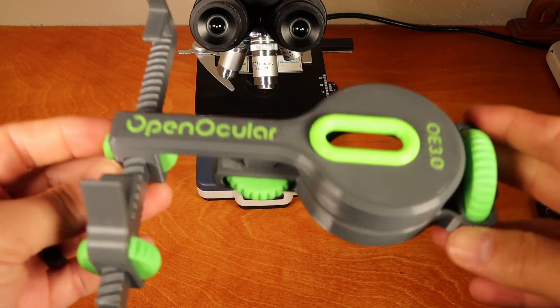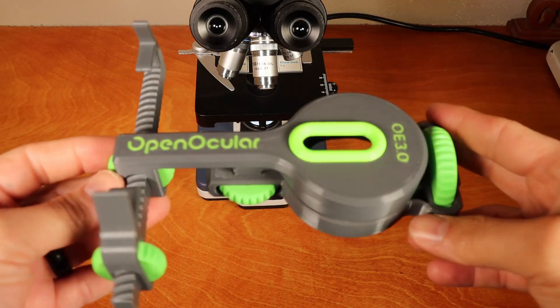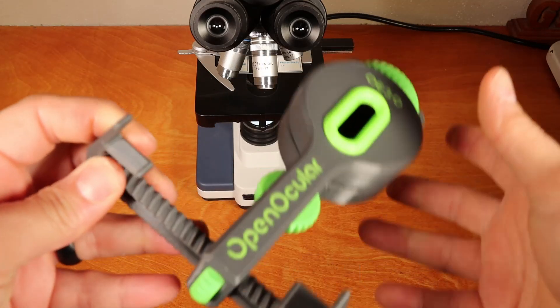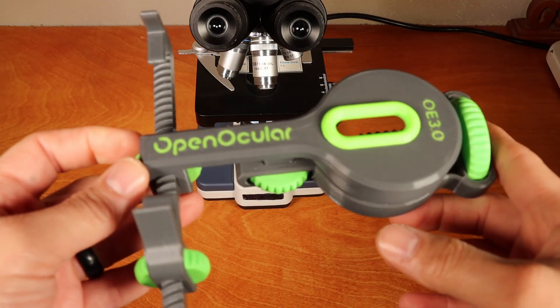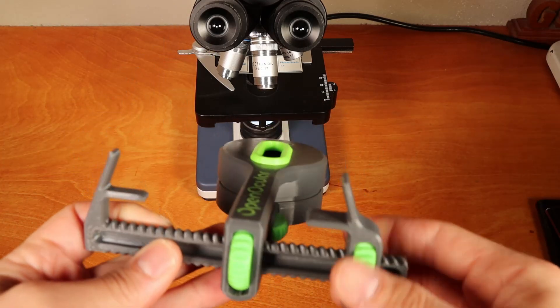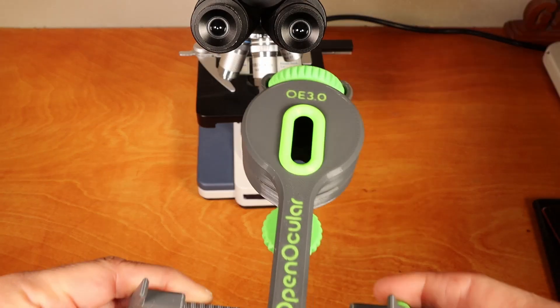This is a microscope to smartphone adapter. It's created by OpenOcular and is 3D printed entirely. This is something you can actually go on OpenOcular.com and download yourself. In this video, I'm going to show you how to set up everything so that you can get started with your microscope adapter right away.